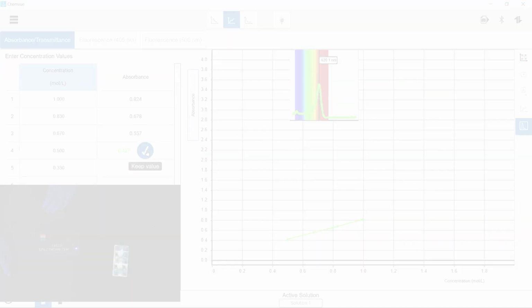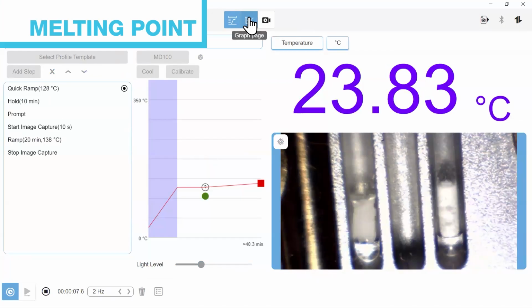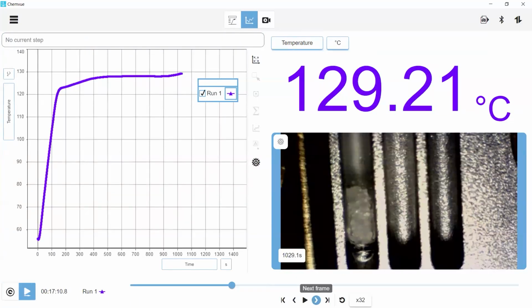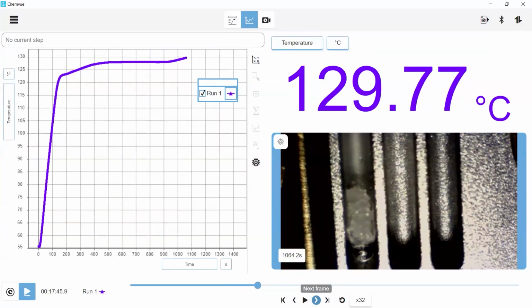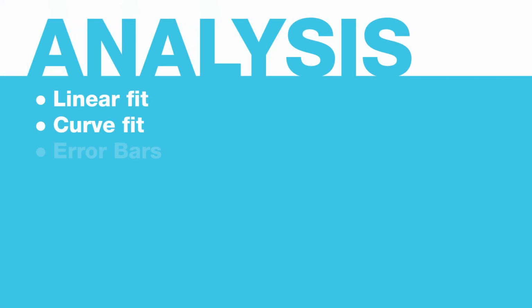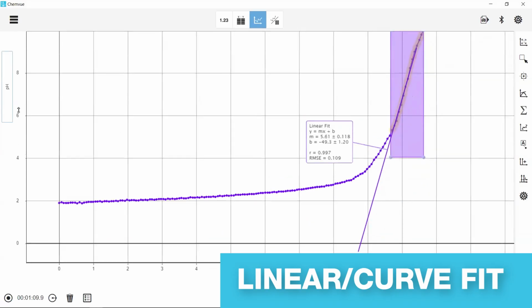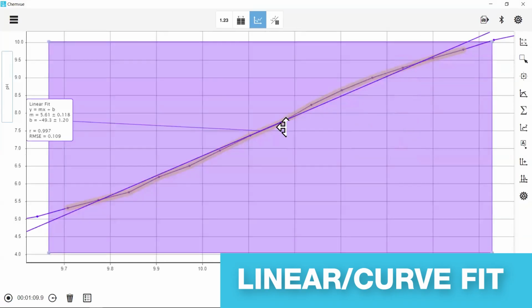We picked the brains of real chemistry teachers and professors. They gave crucial insight into which tools should be front and center. Custom build your own display views, combining graphics, digits, and video displays. You and your students can quickly become pros at Chemvue in your labs. It will be a smooth transition to using the improved analysis features tailor-made for chemistry topics.